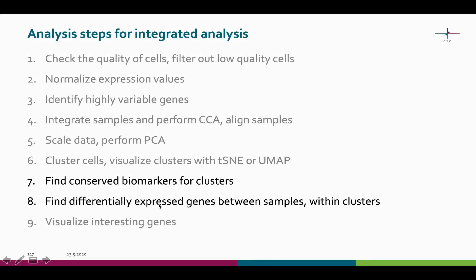The final step in the integrated analysis pipeline is to compute the differentially expressed genes between the samples and the conserved biomarkers for the clusters, and to visualize these. In Chipster you can use one tool to get both gene lists for one cluster at a time. For the visualization tool you can list one or multiple genes.